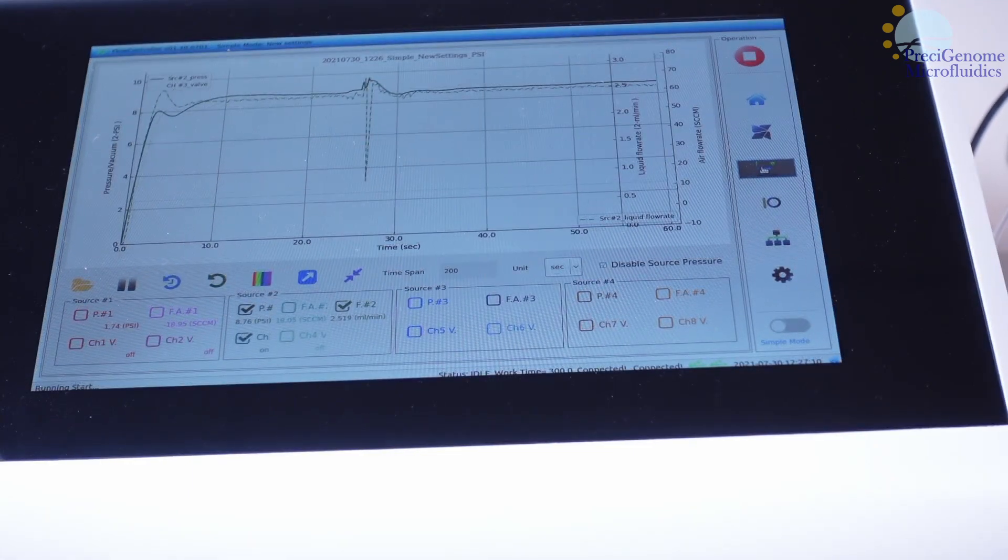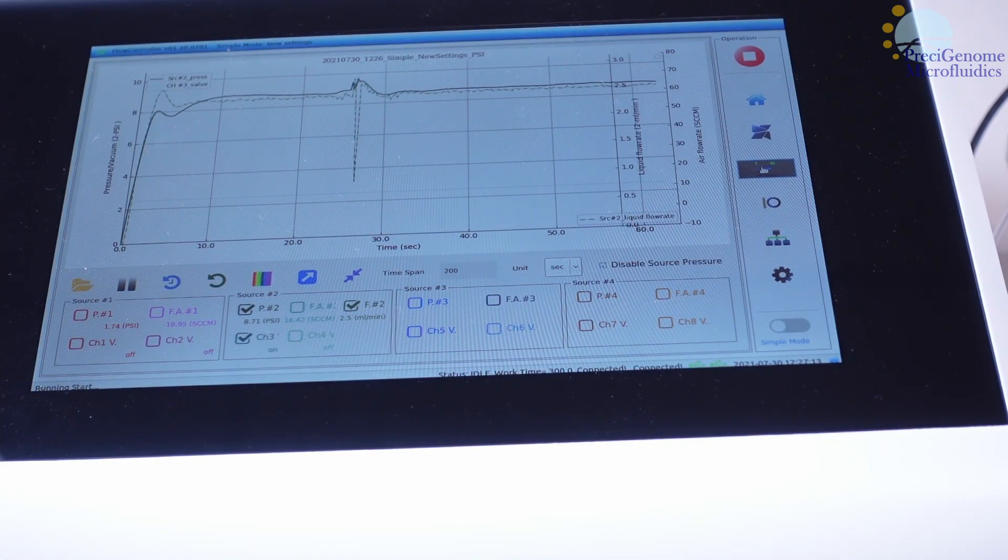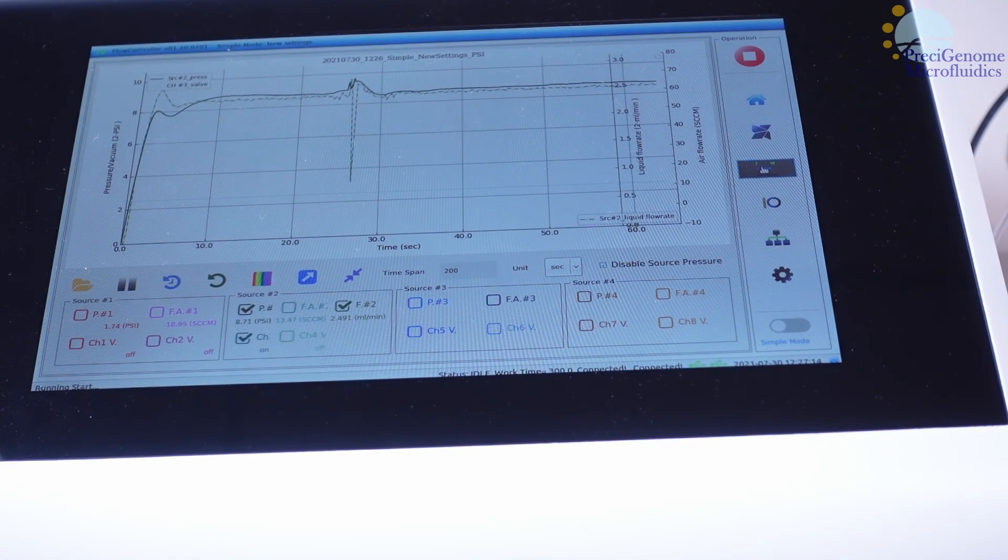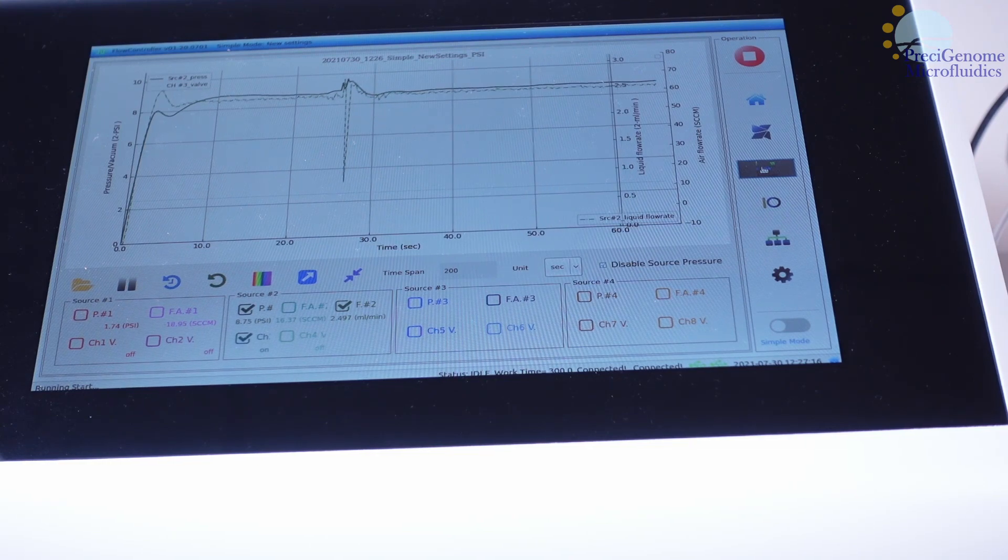We are only showing one target flow rate, but you should test for at least five to gather sufficient data.